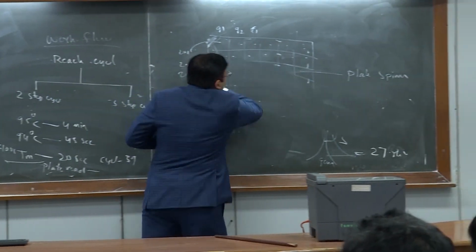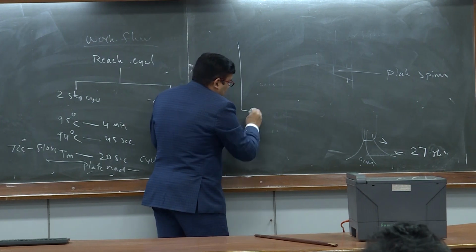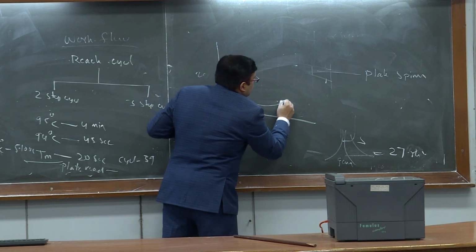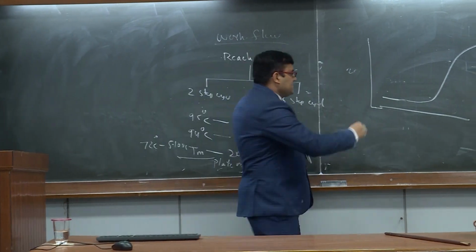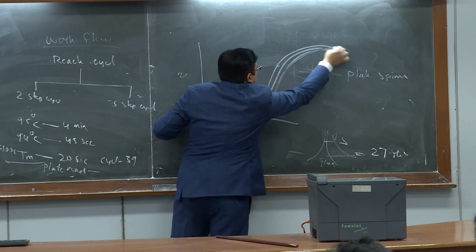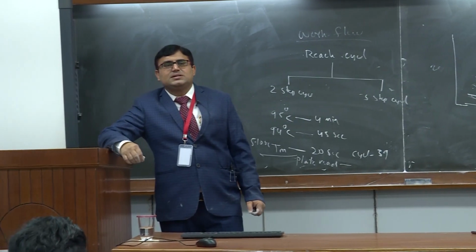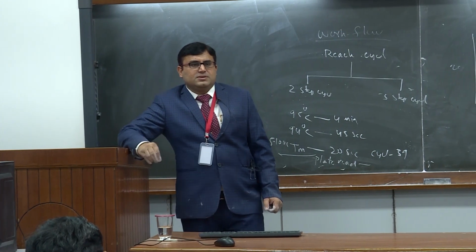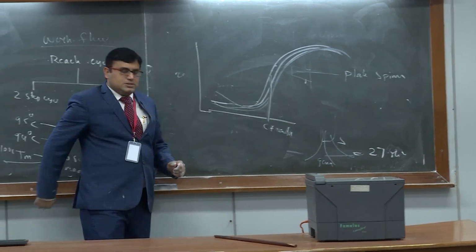And when you see the graph, it will be something like this. Different reactions will show different types of graphs. But if you get a sigmoidal graph like this, it means the primer worked nicely and you got the perfect CT value. So this particular portion represents your CT value.